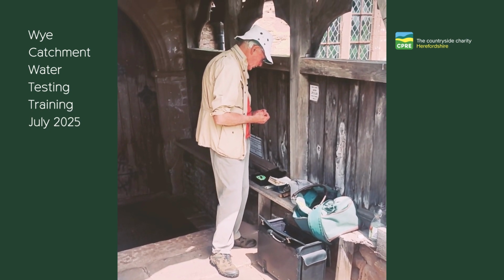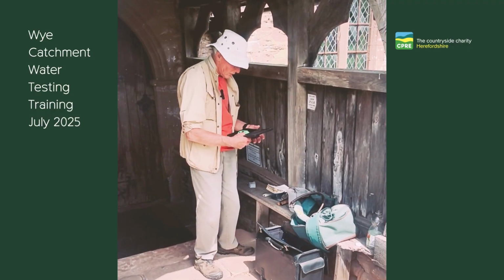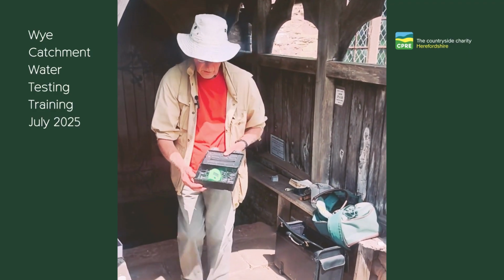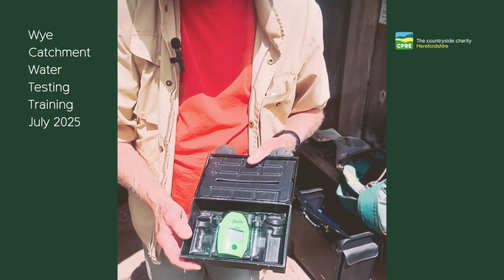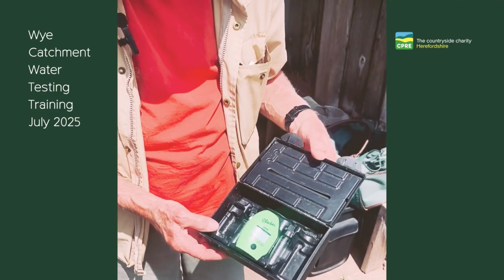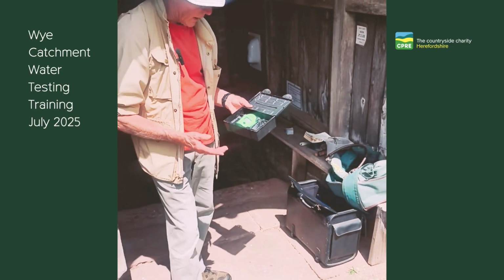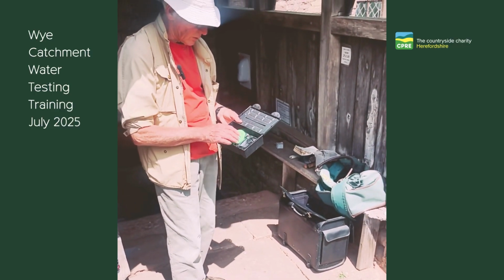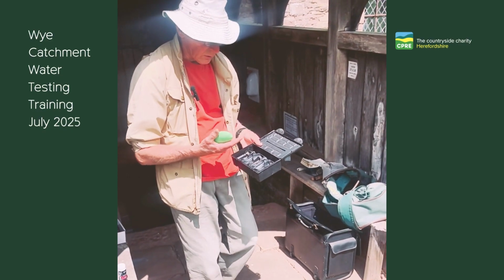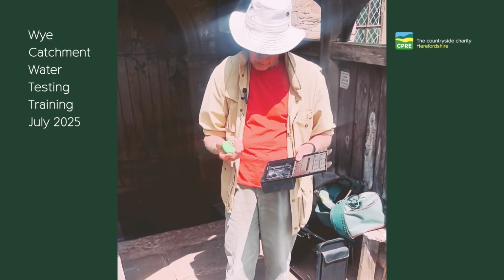Hanna phosphate testing, which is a rather more sophisticated test using this device, which is a Hanna checker. This is my own model, so it's a bit grubby. It's been in use for about 3 years. And it works basically on the color of the sample after a reagent has been added.